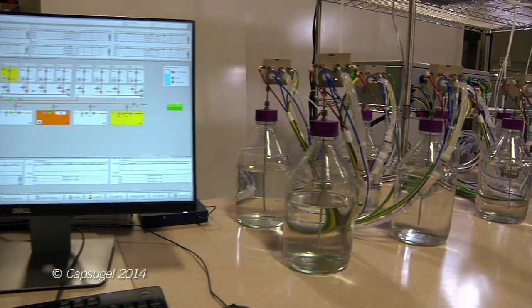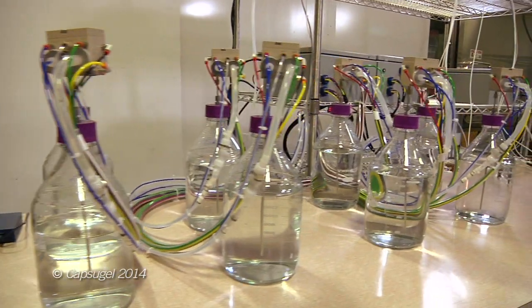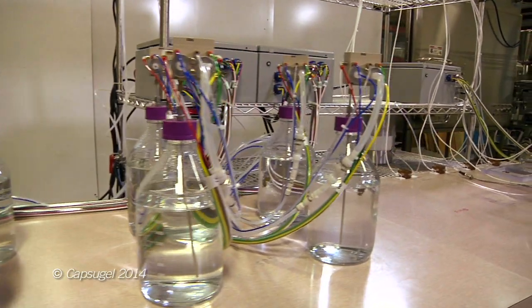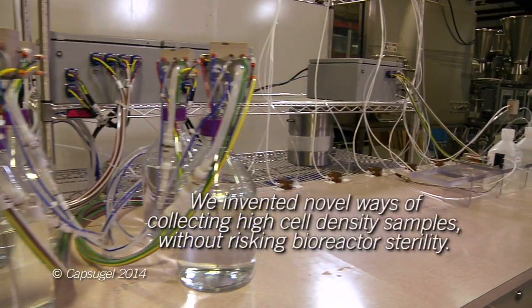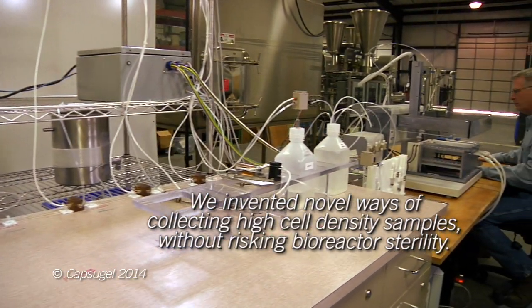Four years ago, Pfizer came to us with a difficult bioreactor sampling problem that no one in the market was able to adequately address. Putting our engineering hats on, we invented novel ways of collecting high-cell density samples routinely without risking bioreactor sterility.